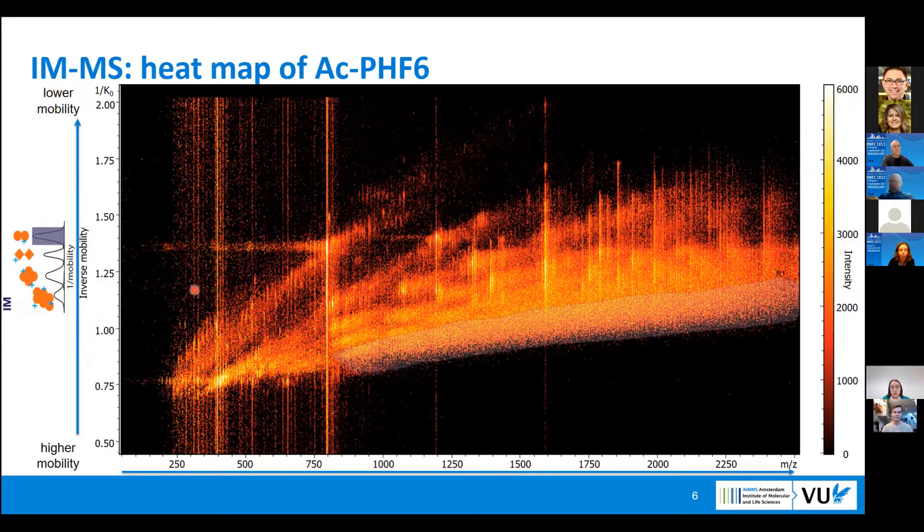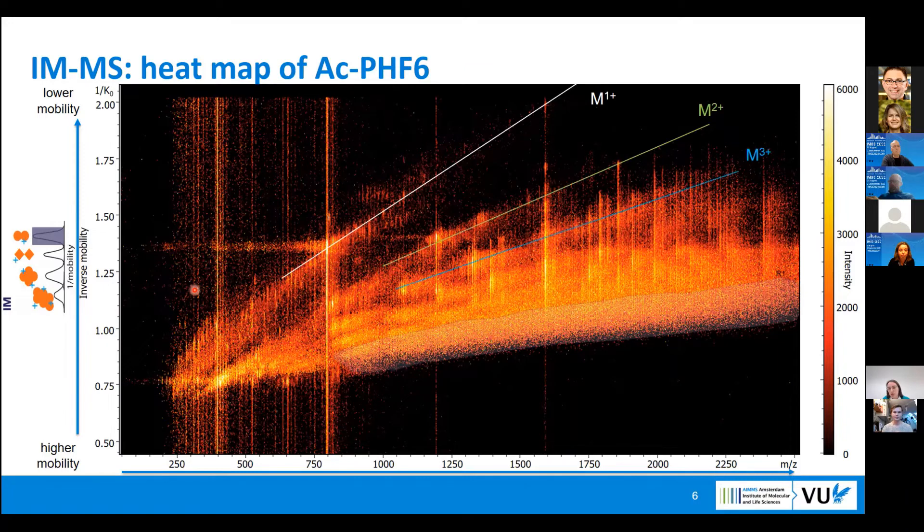What we see on the heat map: we can follow the charge state trends. We have singly charged ions, we have doubly charged, triply charged, et cetera, up to the aggregation region, how we call it, where we cannot see really separate different charge states.